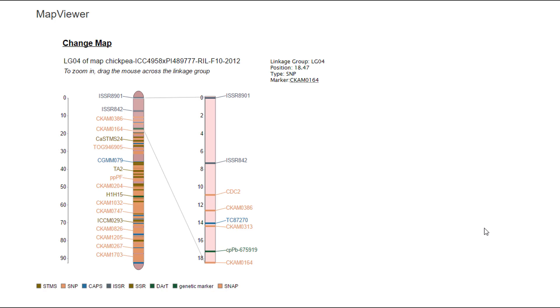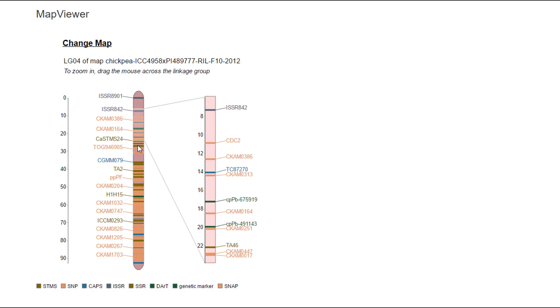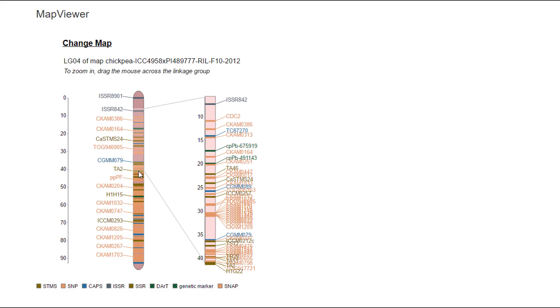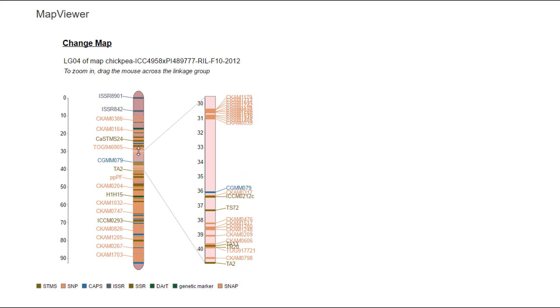In the Map Viewer window there is the static linkage group on the left and a magnified region of the linkage group on the right. The region on the right can be changed by clicking and dragging and changing the size of this window on the left side linkage group.